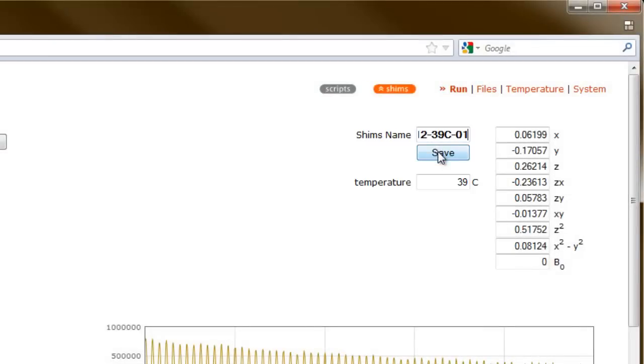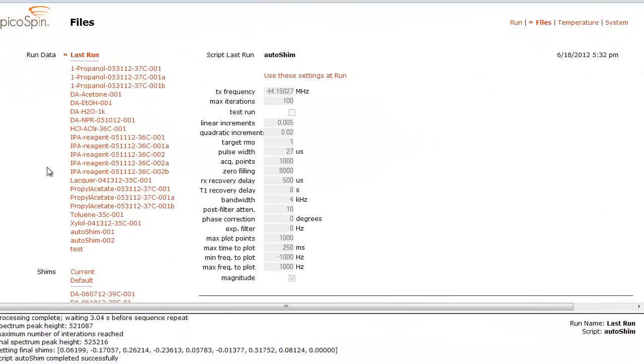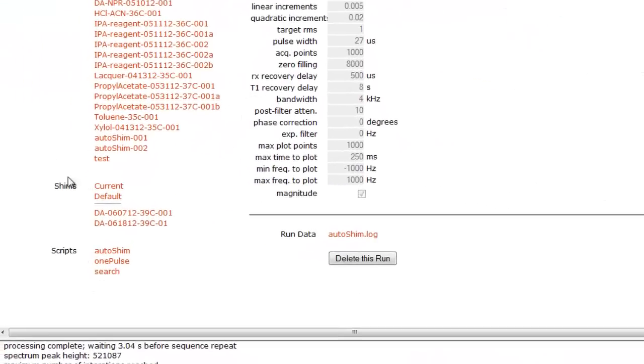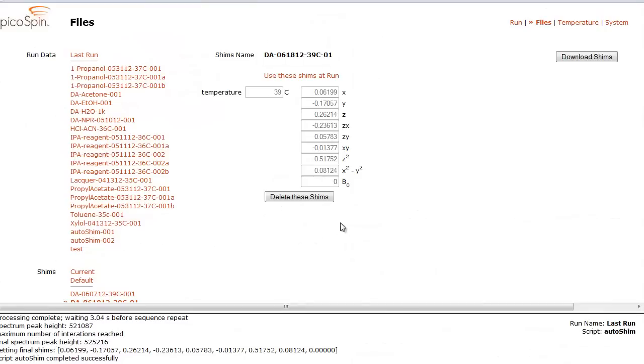By clicking the save button, these shim values will be written to a file which will be stored on our instrument. We can access this file by navigating to and clicking the files button. This loads the files page. Scrolling down to the shim section, we can see the file we just saved. I can access this file by clicking it. Once the page refreshes, we can see our saved shim values.